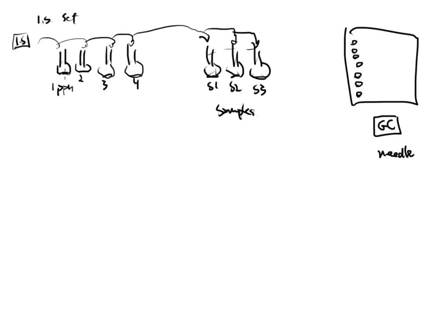All right, well, this is a standard and an internal standard. So what should happen here is that I should get a signal for the standard that I have used, right? And I should also get a signal for the internal standard that I have also used. So each standard should have 2 positive signals.